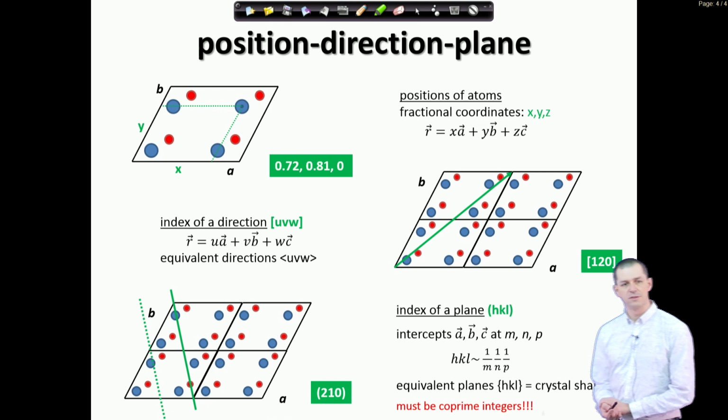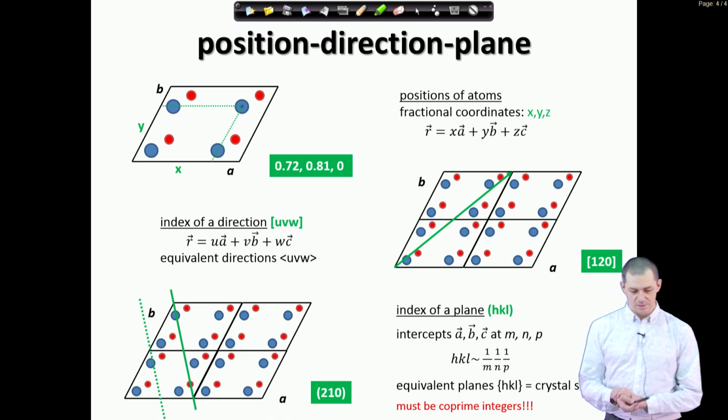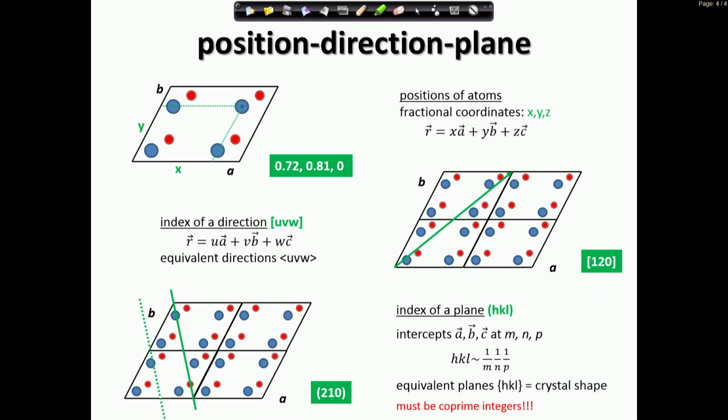When characterizing the structure using the unit cell concept, or the lattice concept, we meet various types of coordinates, or say objects or mathematical concepts. And so it's useful to review them now.